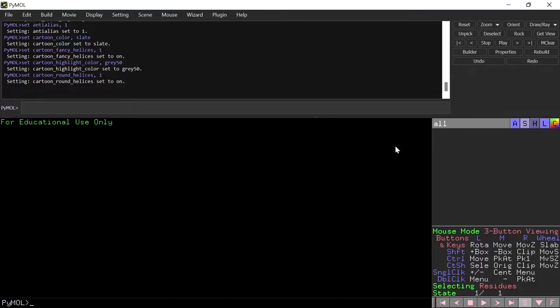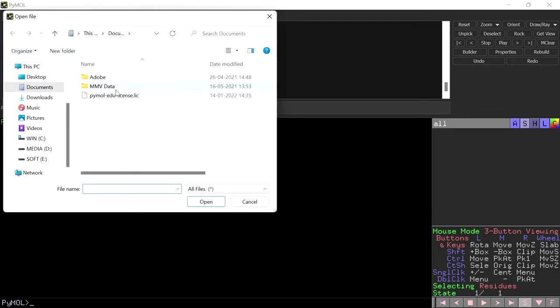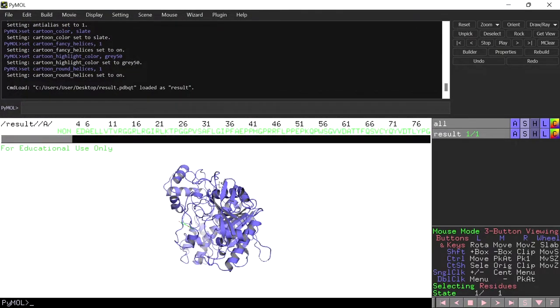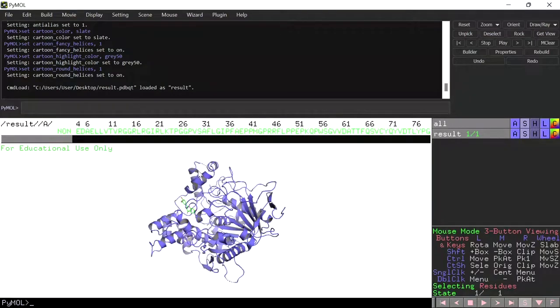Let's start with the PyMOL interface. PyMOL can display more than one object at a time. First, open the AutoDock result PDBQT file. This is the PDBQT file of the AutoDock result.